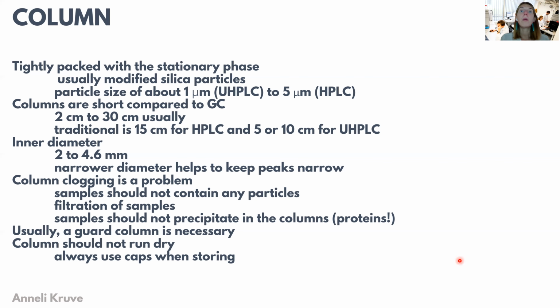And the reason why UPLC columns are shorter is because in UPLC usually we already with this length of the column do achieve a reasonably good separation.